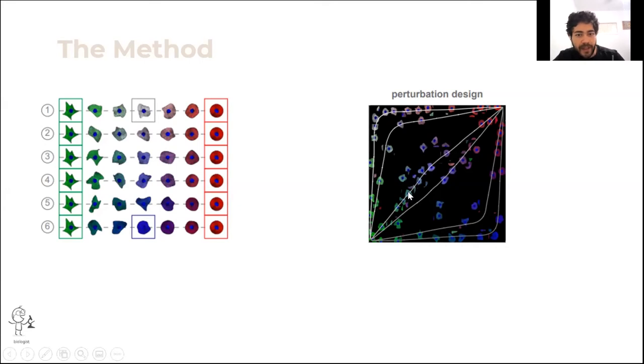Then 10 microscopy experts were divided into two groups and asked to identify the distinct underlying processes. Basically, they were asked to define image sets containing cells or cell trajectories with similar behaviors. One group used the regression plane method and the other didn't.